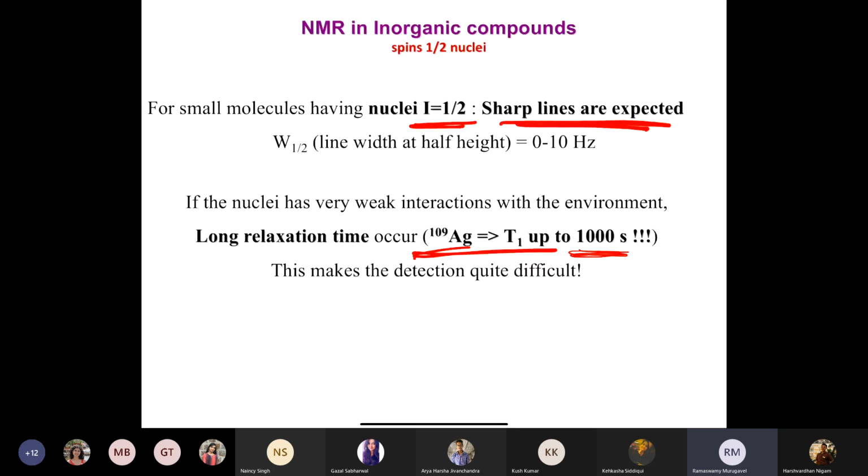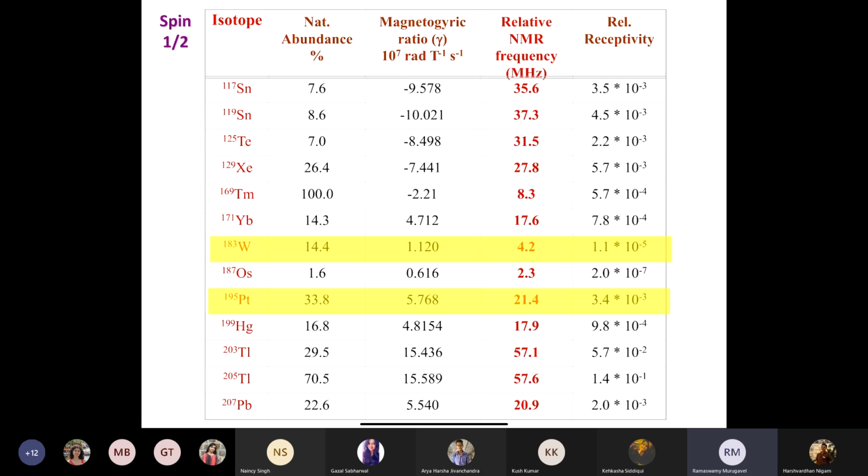There are other problems which I have not talked about before. I talked about tau. So, okay, the tau here is 1000 seconds. This is too sluggish. It does not relax at all. Even these are problematic systems. Okay, again, just for information, I'm not going to really dwell too much upon that.